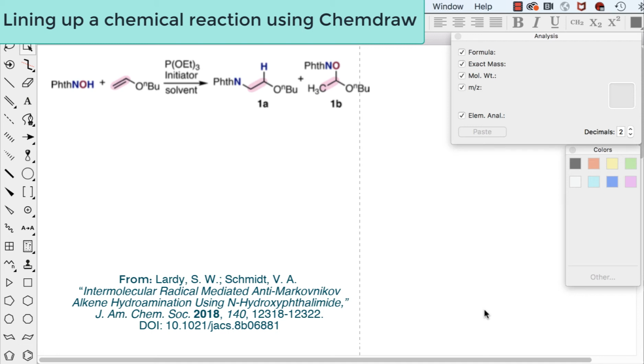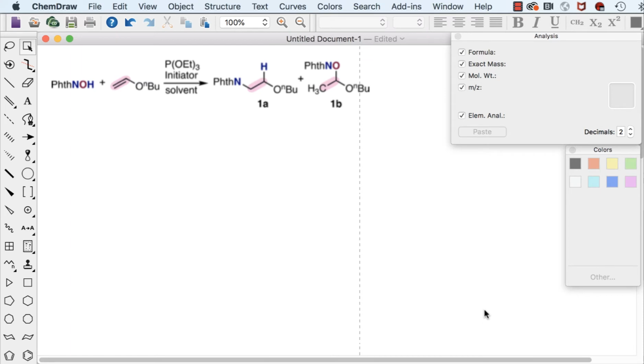Welcome! In this video we're going to learn how to draw a reaction scheme in ChemDraw, making sure to line up all the components of the reaction, and also learning how to use some colors to highlight certain bond forming and breaking events. First, we're going to type out our various components of the reaction. We can draw our next components.